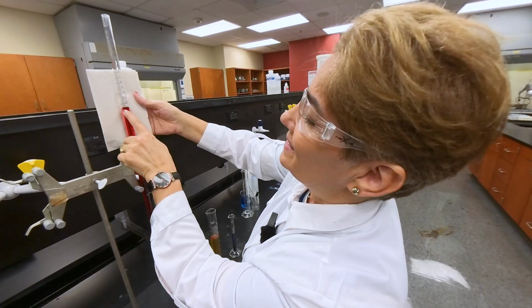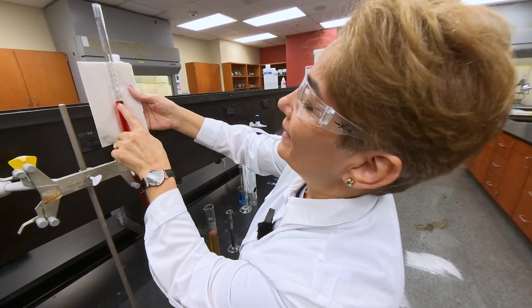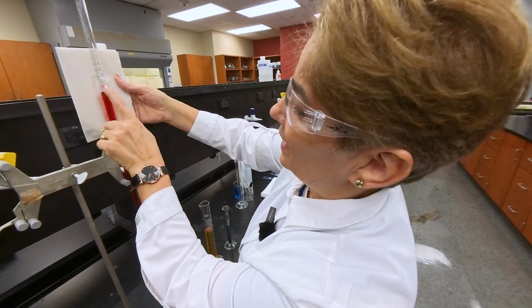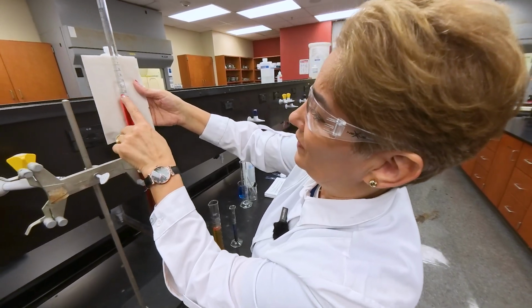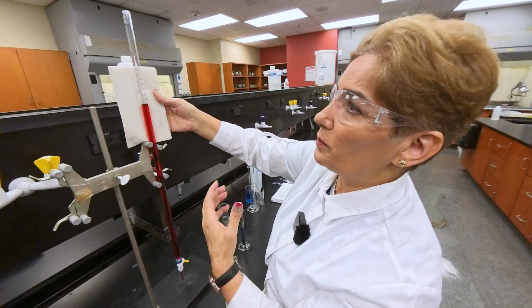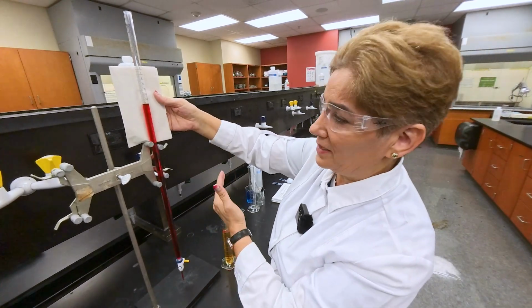What is that exact number that you can estimate based on the level of the meniscus? I gave you enough information. It's between 12.9 and 13, so it's going to be 12.9 and something.